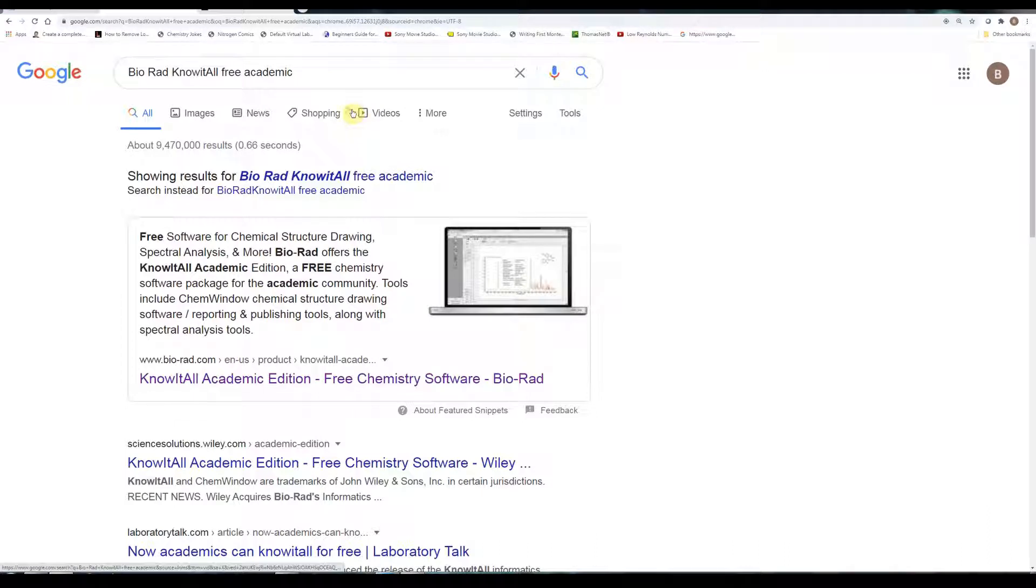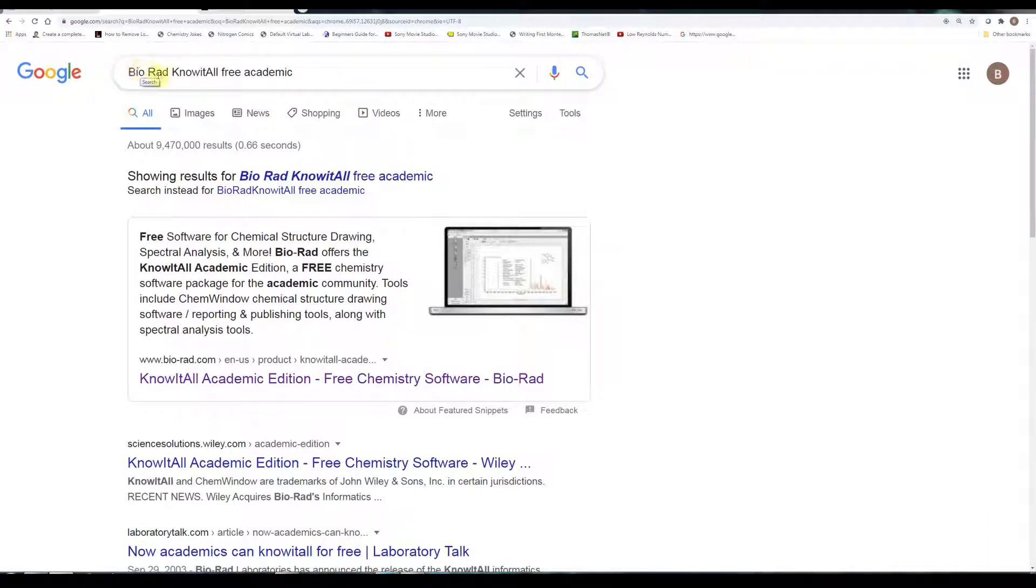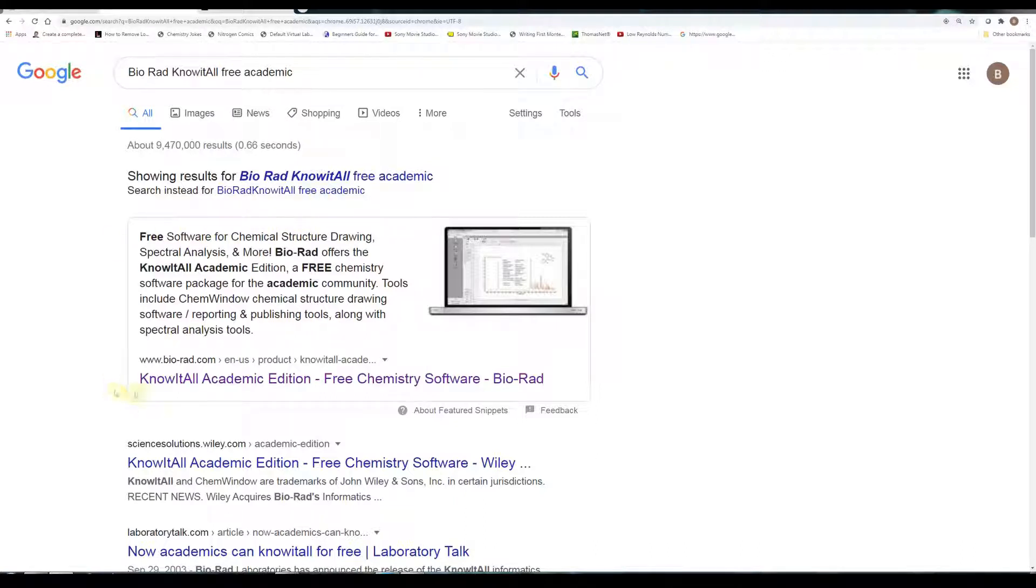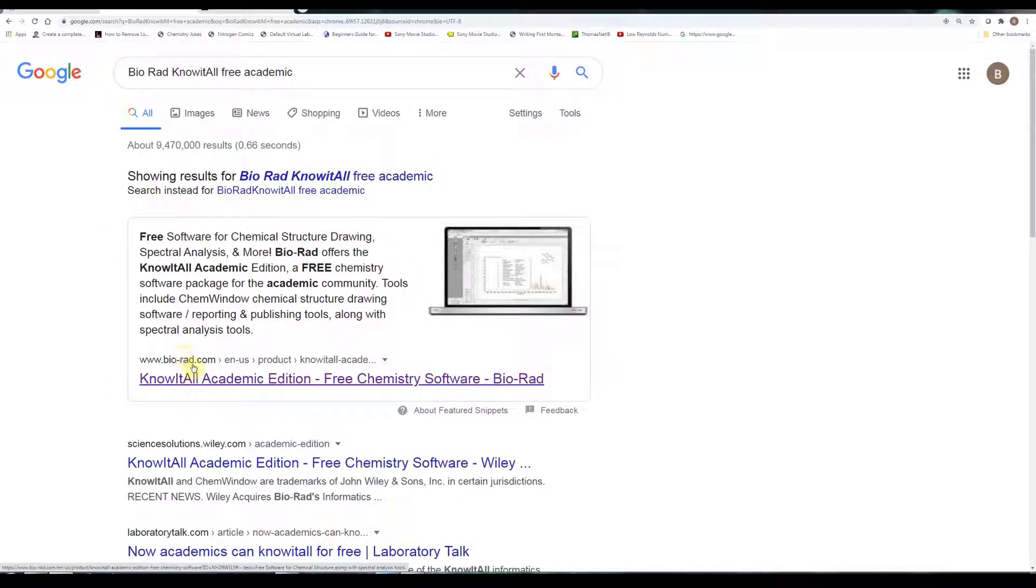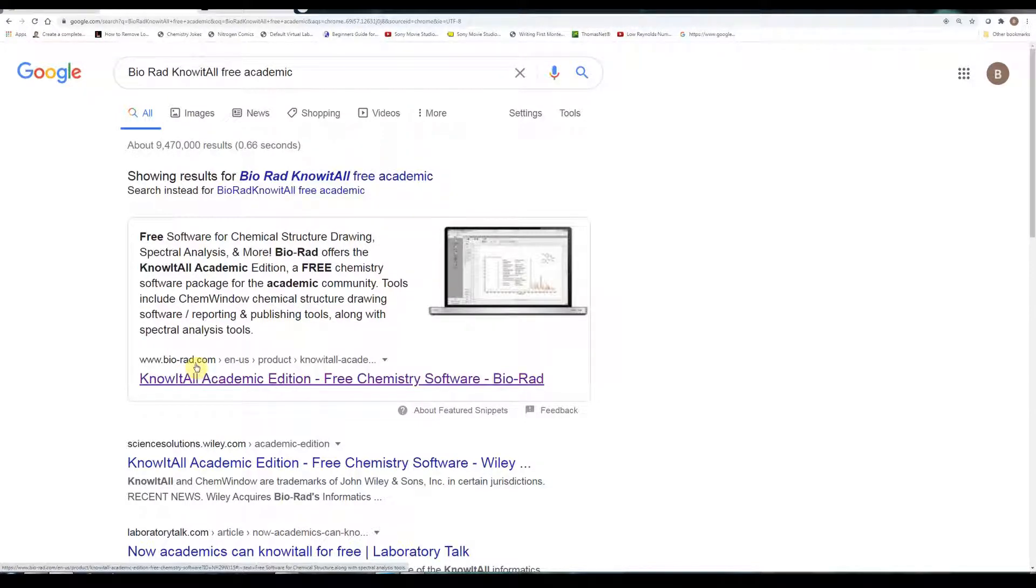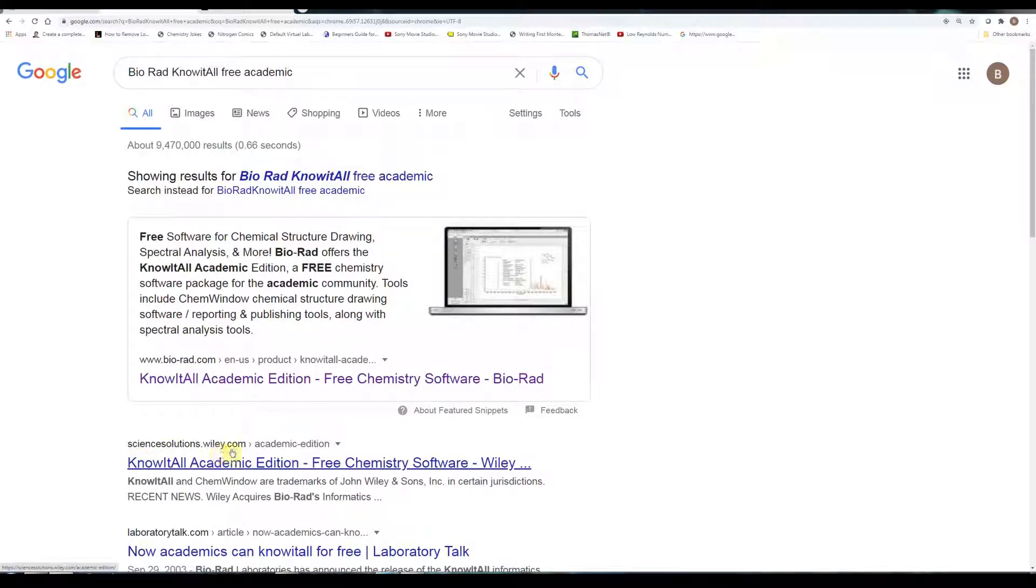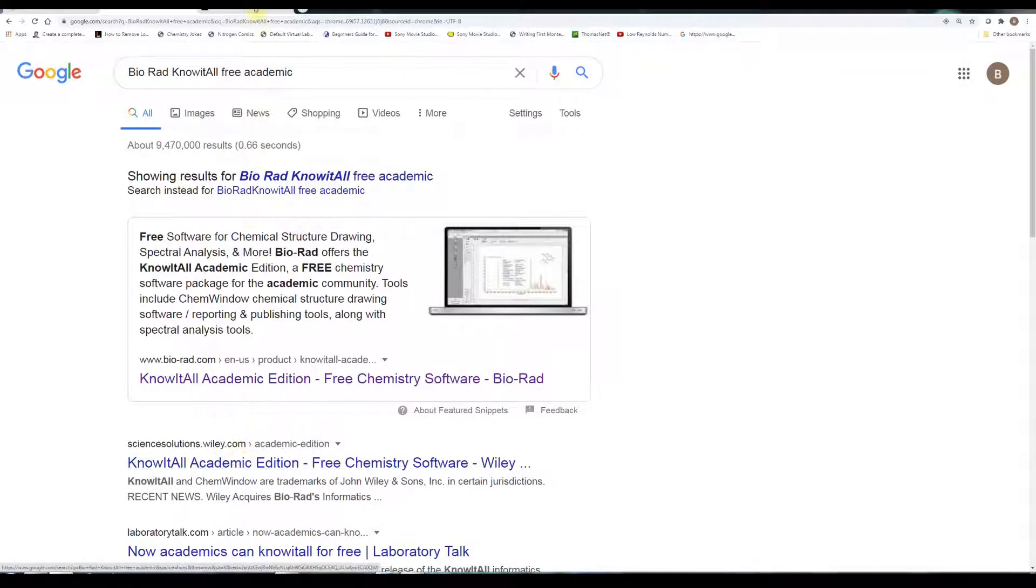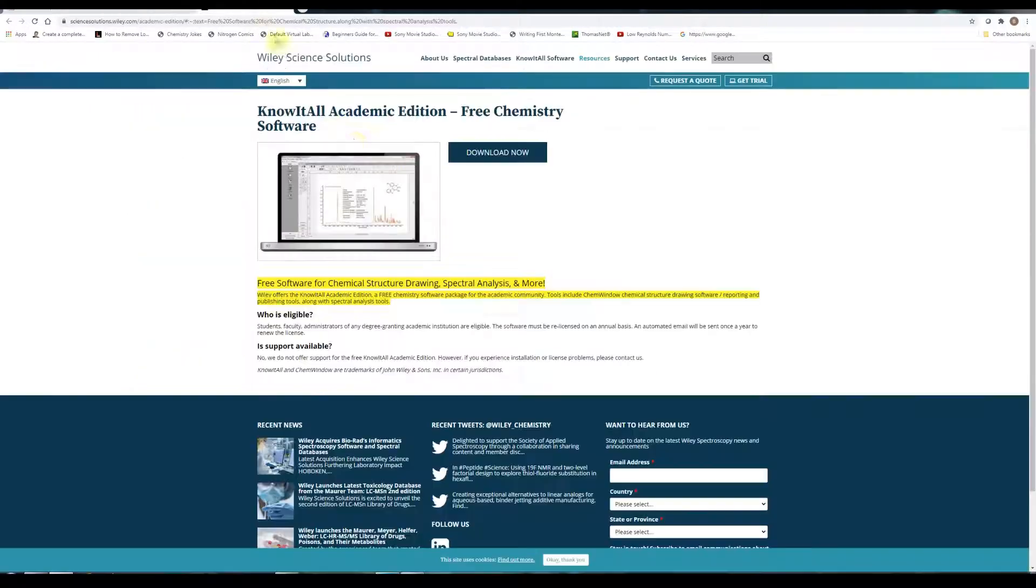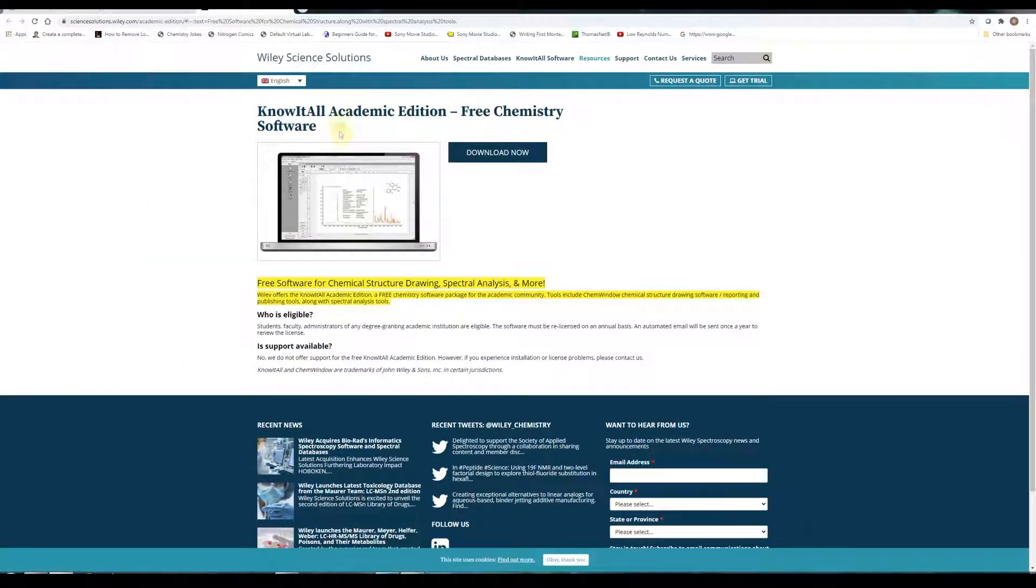To find this, simply Google search something like Bio-Rad Know-It-All Free Academic, and you see immediately I've found that. This is the official website, but whether I click on Bio-Rad's website or science solutions at johnwiley.com, I come up to the same website. It appears as if John Wiley has purchased Know-It-All.